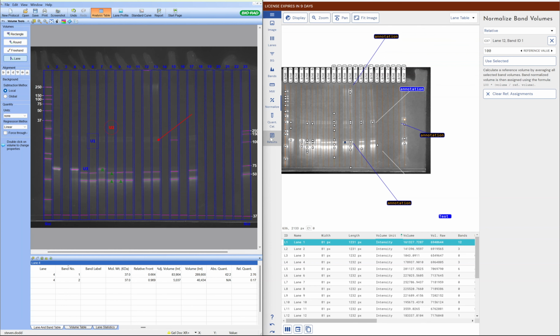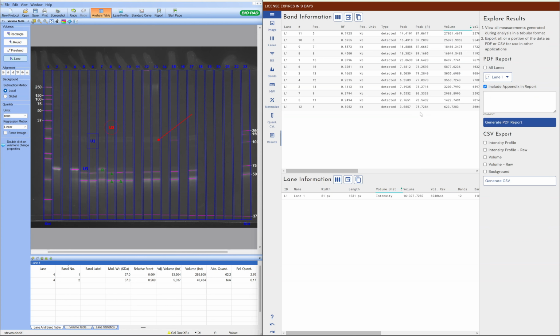So finally, we'll come through to the results section, the exporting. So I assume, as this is a table, you can copy and paste it to Excel. So you can copy it to the clipboard and you can export it to Excel in a file. Again, we can do that with these buttons here, copy to clipboard, export to a file, things like that.